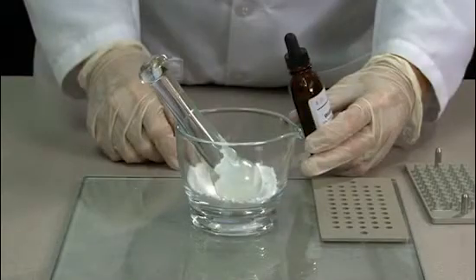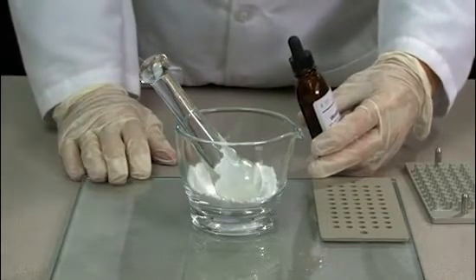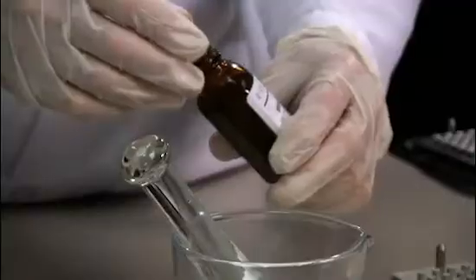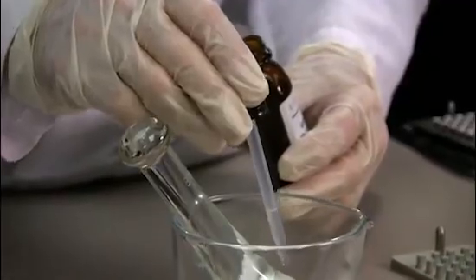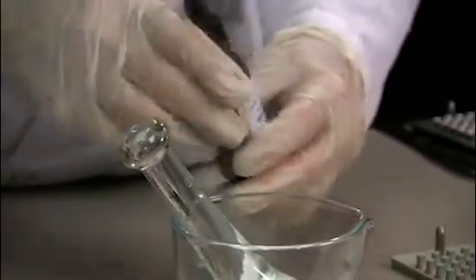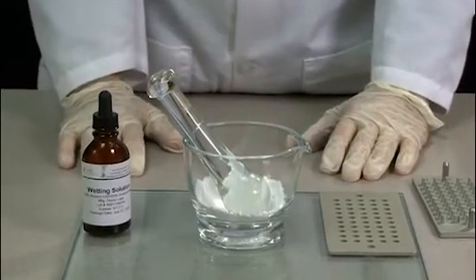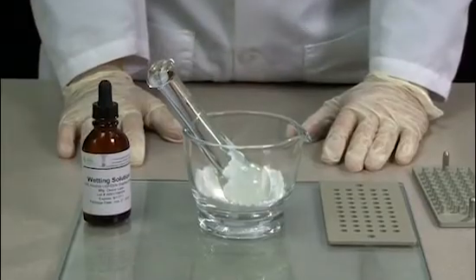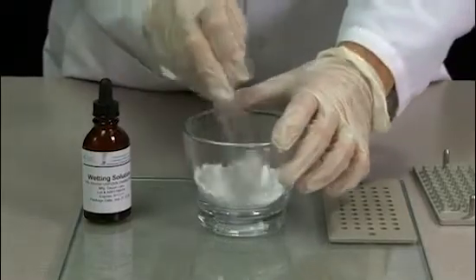We will use a wetting solution to begin to dissolve the sucrose. This wetting solution has both alcohol and water in it, and like the percentage of sucrose that is used in a formulation, is experimentally determined. This contains 75% alcohol and 25% water. The alcohol is there to aid in the evaporation of the solvent from the tablets. The water is present to help dissolve the sucrose, which will impart the hardness to the tablet.